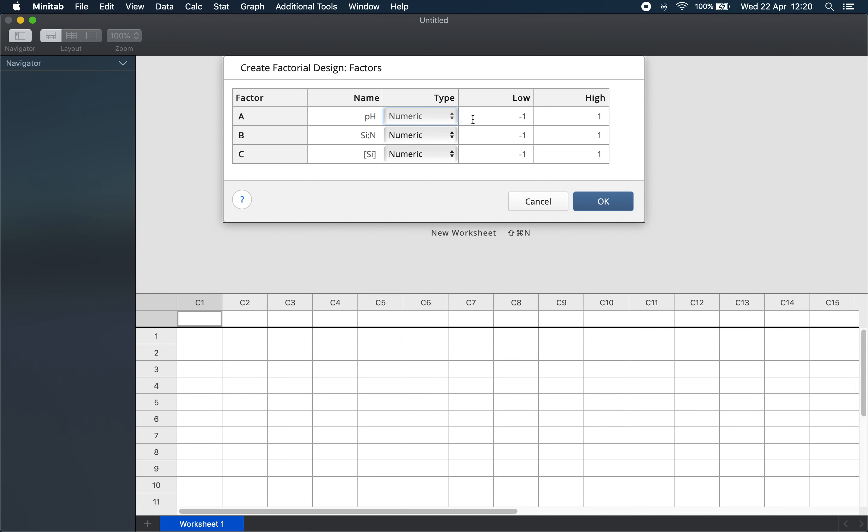Then each factor has a low and a high level. We choose pH 6 and 8, silicon to nitrogen ratio of 0.5 to 2, and silicon concentration 30 to 60. These levels should cover as much of the experimental range as practical.